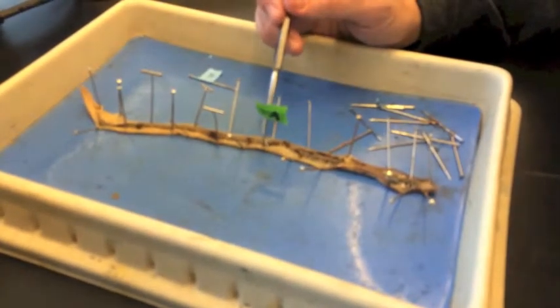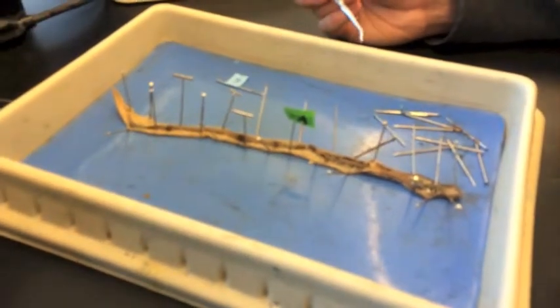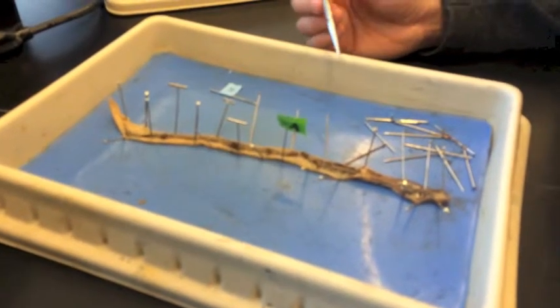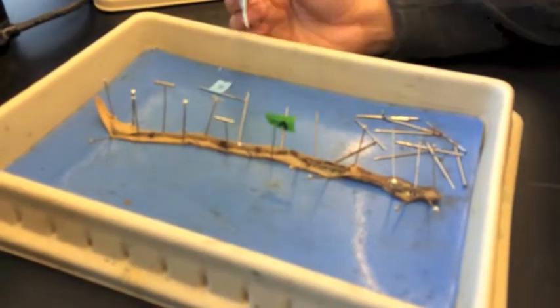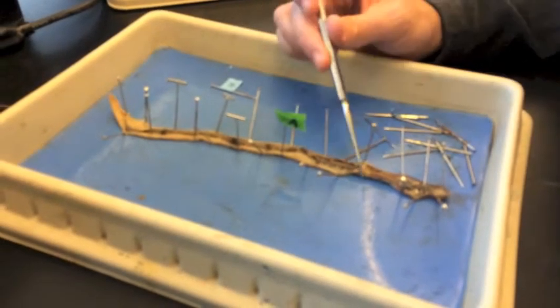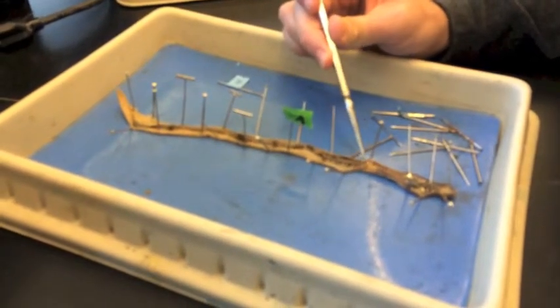In every one there is a squiggle called a nephridia. It's like a little bladder. You can tell it's a coelomate because its intestine is bolted in place and muscular. And then finally you have the clitellum here, which is a raised area for reproduction.